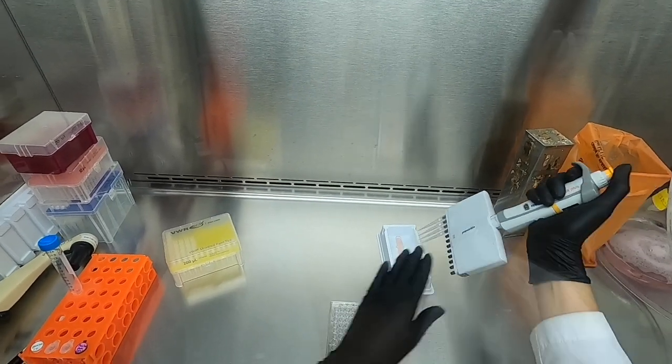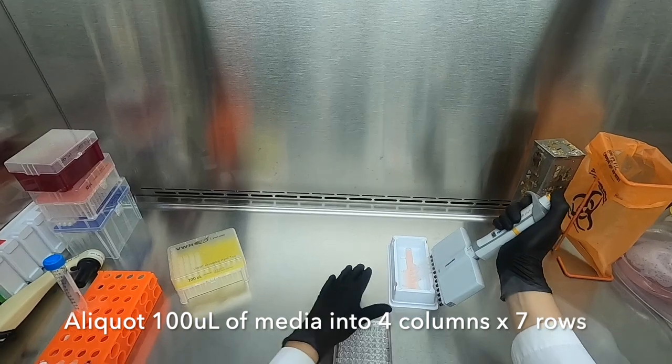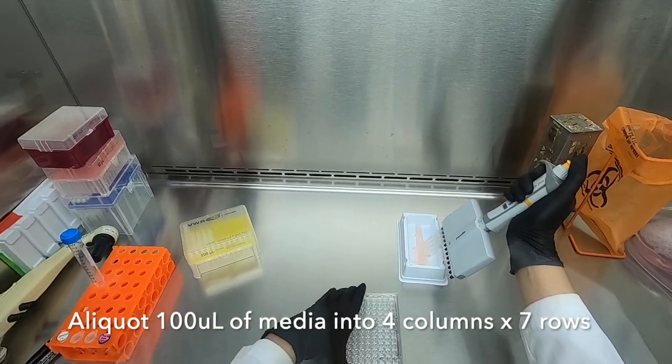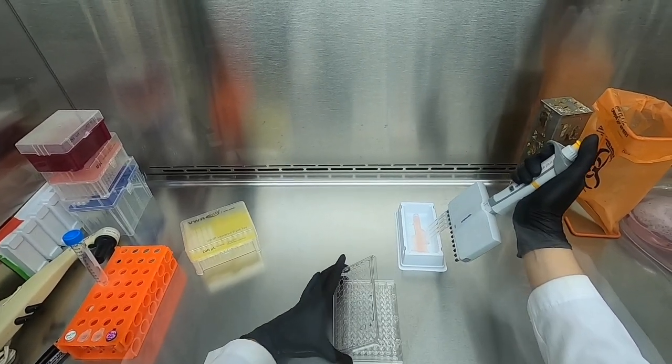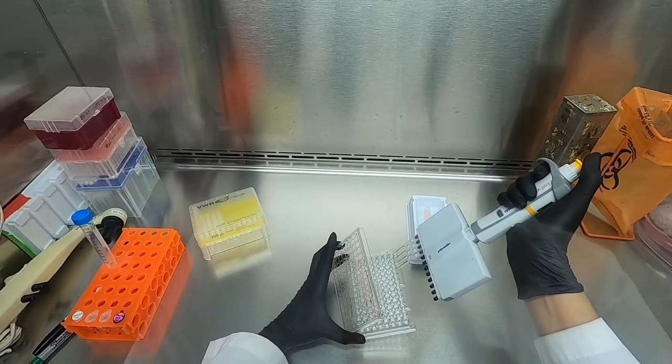We will now proceed to aliquot 100 microliters of media into a 4x7 grid containing our seven concentrations with four replicates for each.